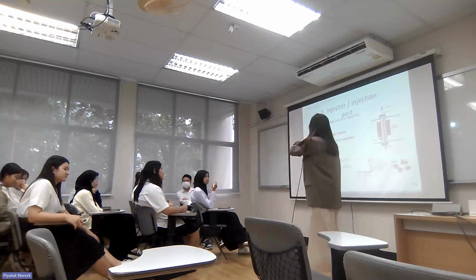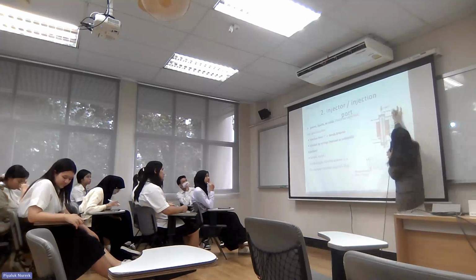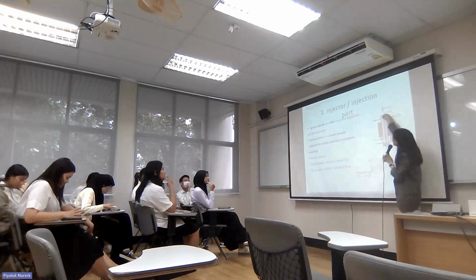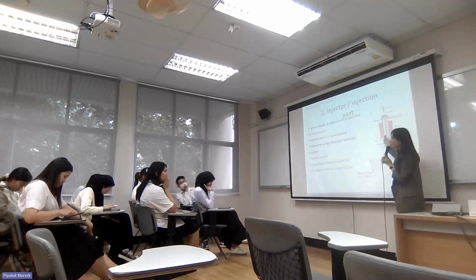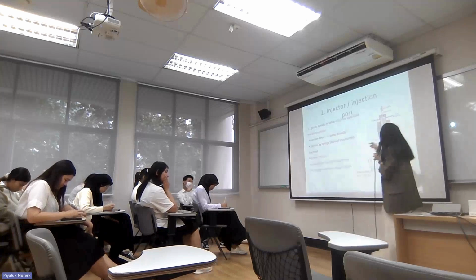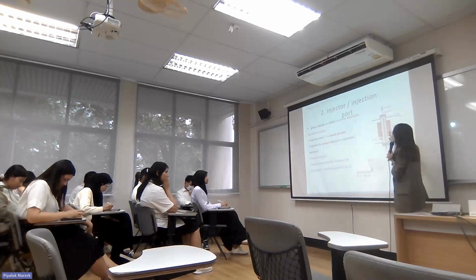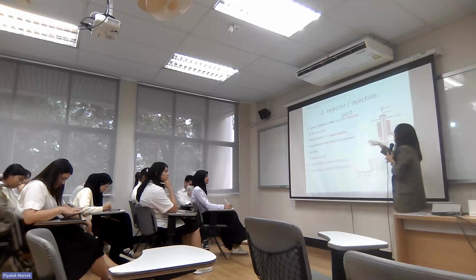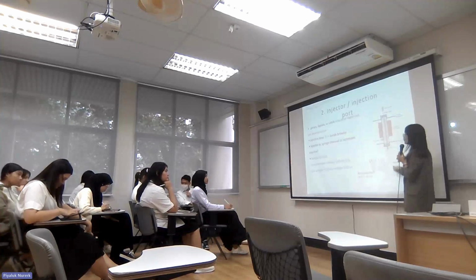In this slide, you can see that the sample is injected from the outside, and before it passes to the column, it needs to be vaporized in the heating box. In this part, we need to fix the temperature higher than the boiling point of our target analyte to make sure it is completely vaporized. And then our compound passes into the column for separation.